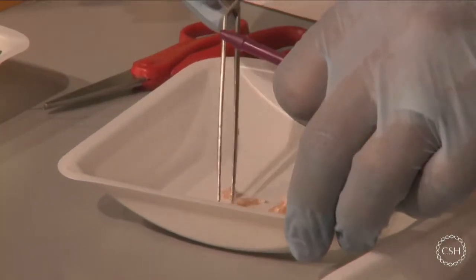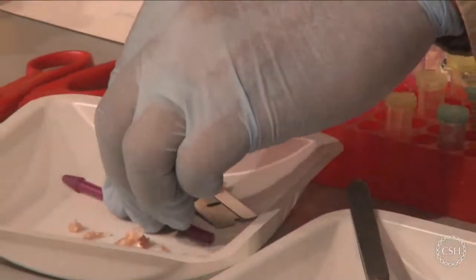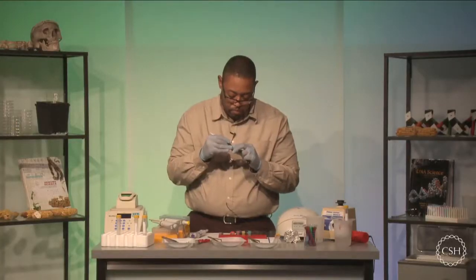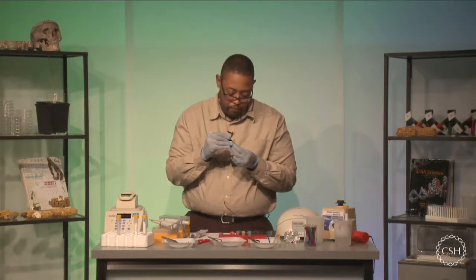So what I'm going to do now is take that piece and add this to my next test tube. And then I'm going to label this sample number two. And this is my pork.